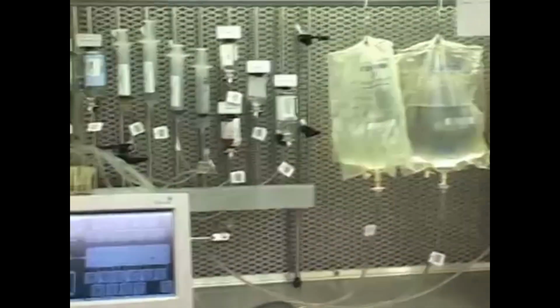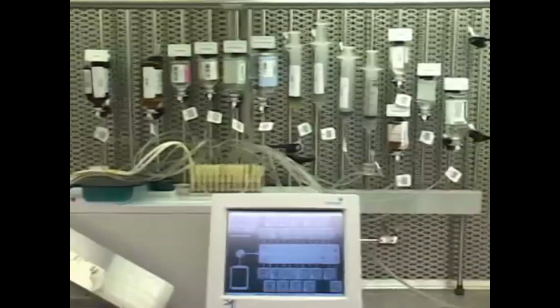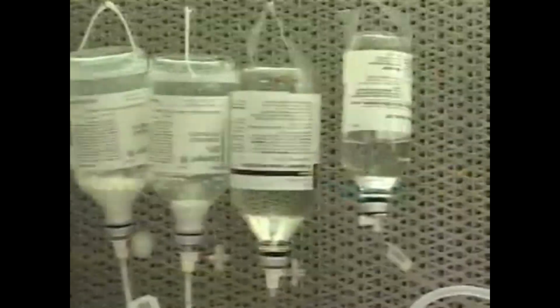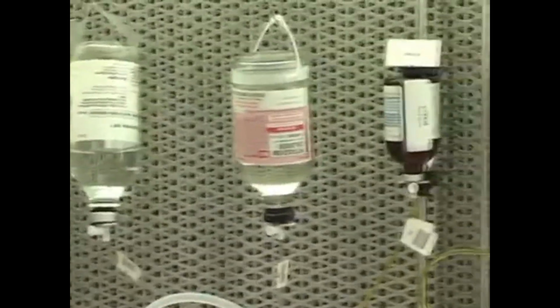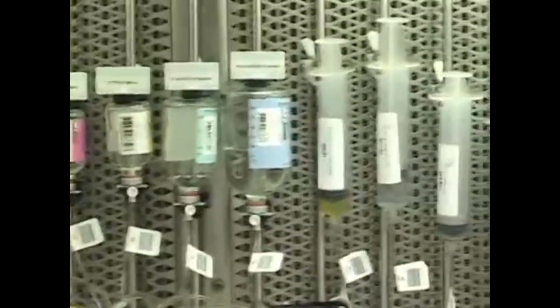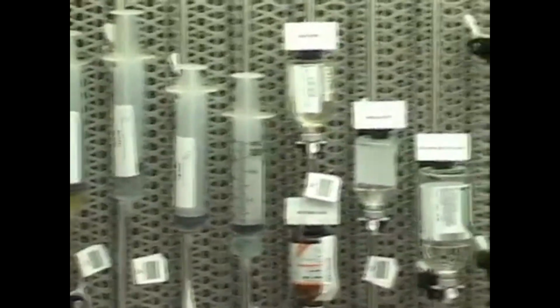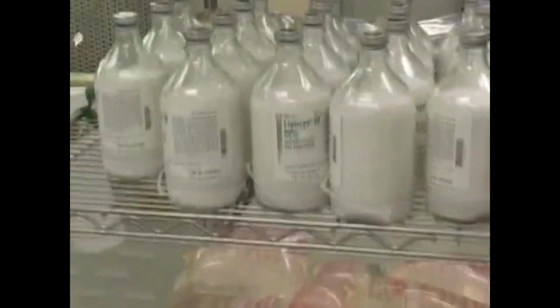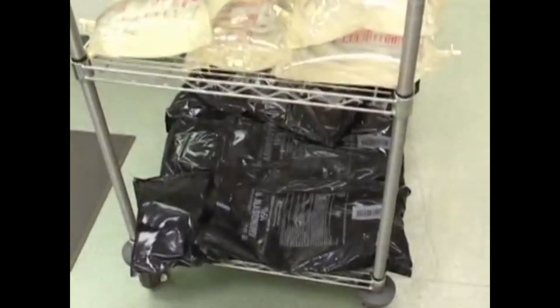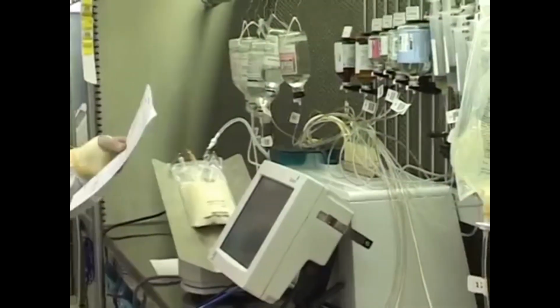We will now talk about automated compounding devices. Automated compounding devices, or ACDs, are specialized equipment used to prepare the TPN solution. Two primary versions of TPN compounders are available. One version provides a separate compounder for the base solutions and for the electrolytes, while the other version uses one compounder to infuse all the compounded ingredients.